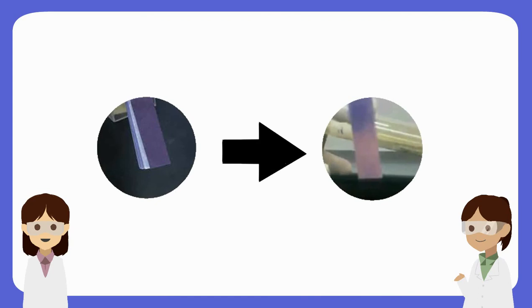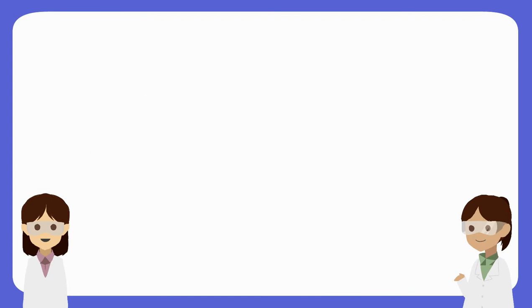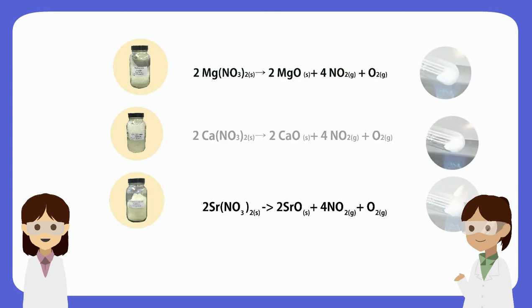The color of the blue litmus paper changes from blue to red, indicating that the substance formed is in acidic condition. The white solids formed from the decomposition of magnesium nitrate, calcium nitrate, and strontium nitrate are magnesium oxide, calcium oxide, and strontium oxide respectively.